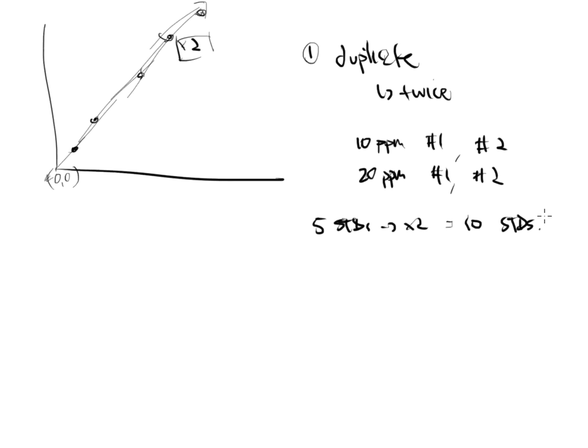Because it looks like if I injected them once and one of the points are not going to fit, then I should automatically pick that up in the regression line analysis and I could leave it out. Well, that's not the point here. The point of running duplicates is to really test your instrument precision.